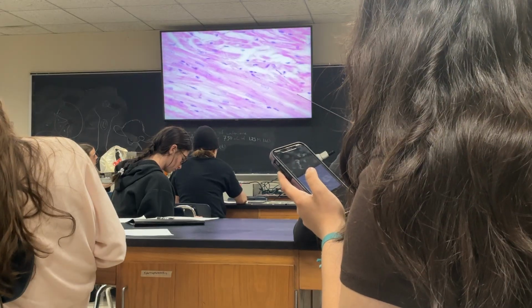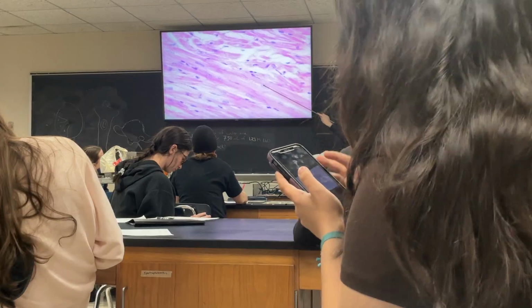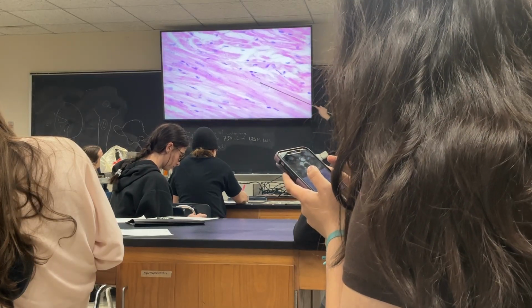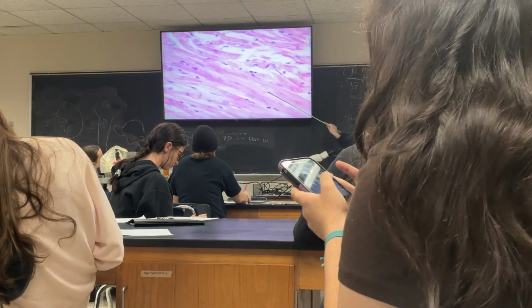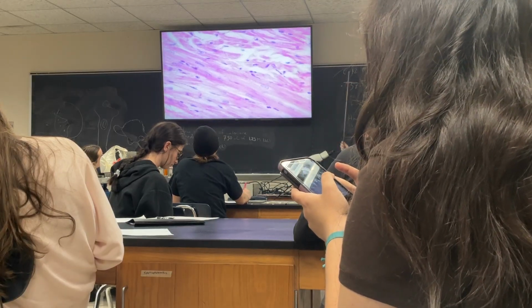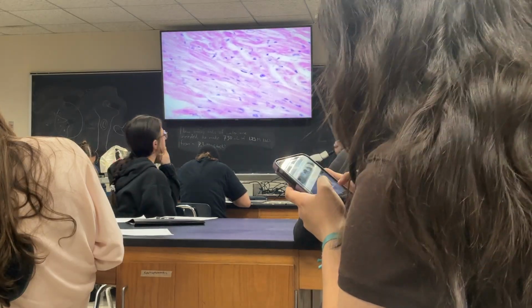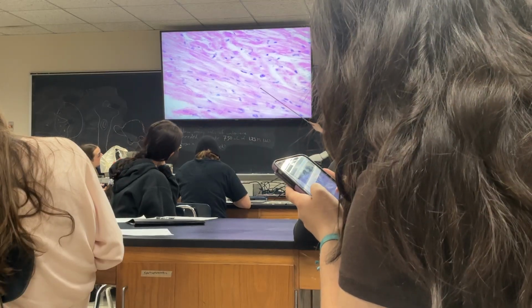Okay, this is one cell. Cardiac muscle cells are pretty big. Here's a nucleus. On either side of it, I see a clearing because those protein fibers, you can see them literally swimming around the nucleus, because that nucleus is in the middle of that cell. Skeletal muscle would be pushed out to the side. Here's some decent intercalated discs as well.